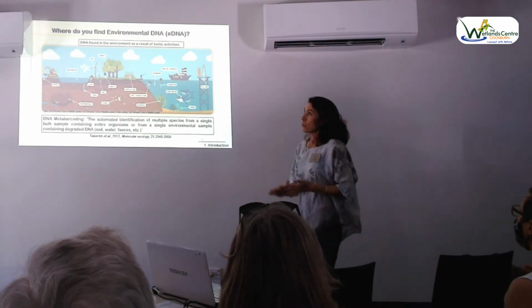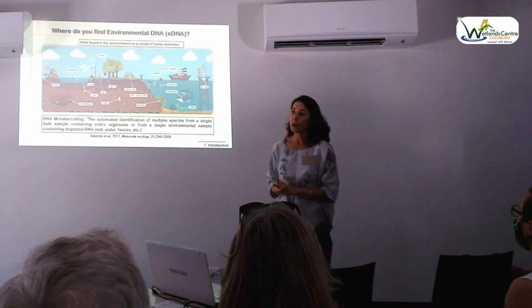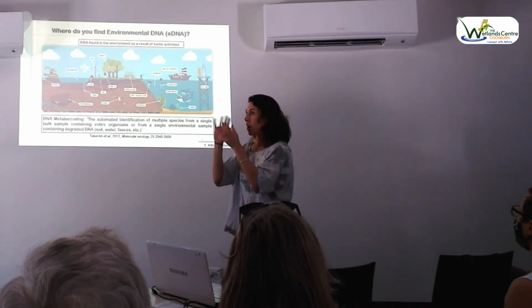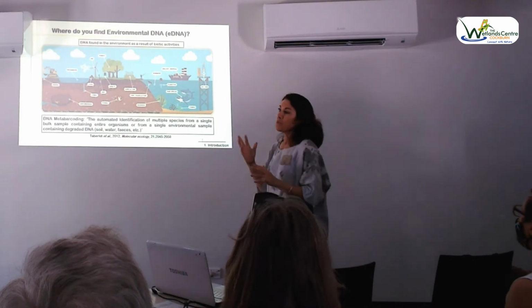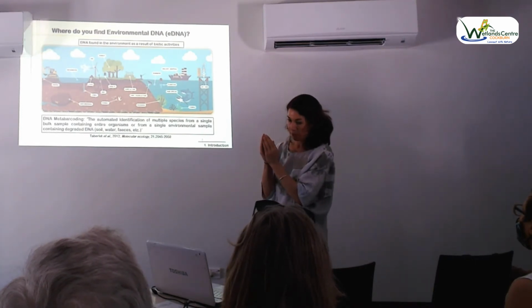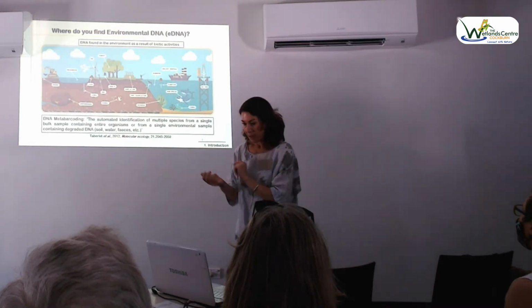Now, before the term environmental DNA came in, we were using the term metabarcoding. That means we take a mixed biological sample, and I'll get into it more later, but that's where you can identify multiple species from one sample. And that's metabarcoding with a bulk sample.